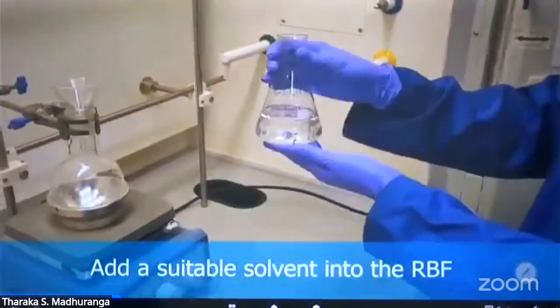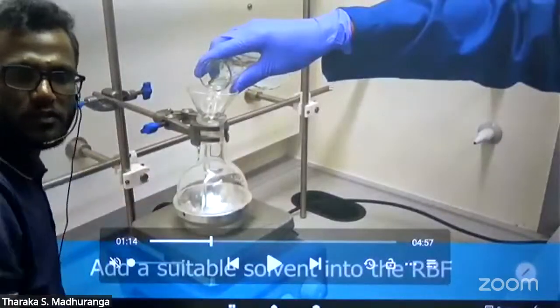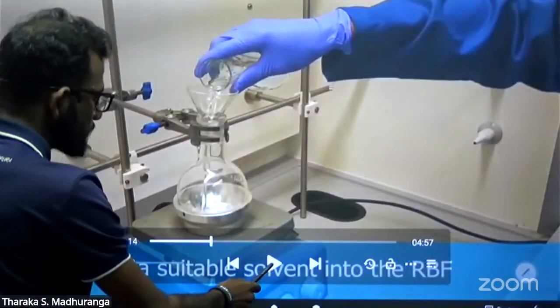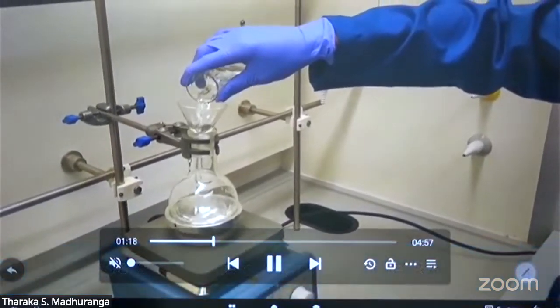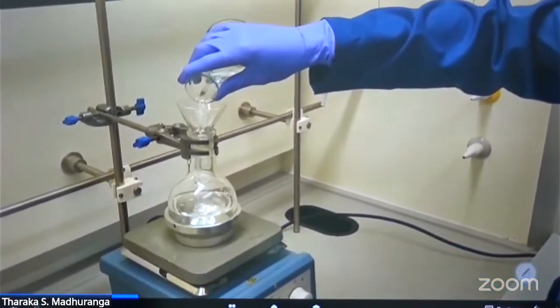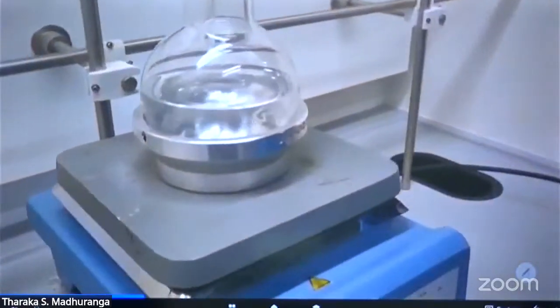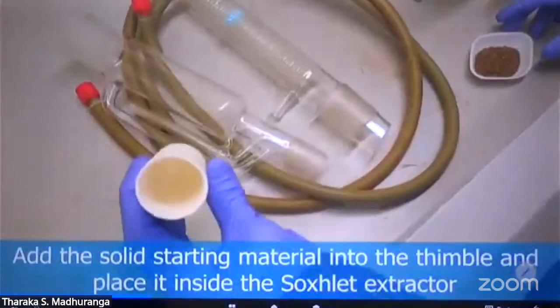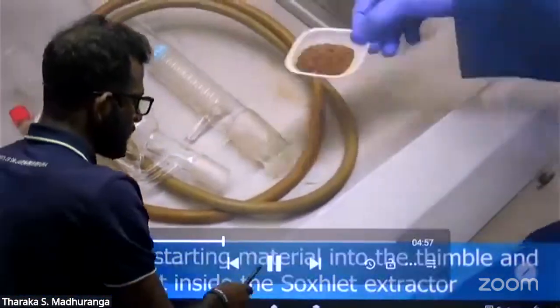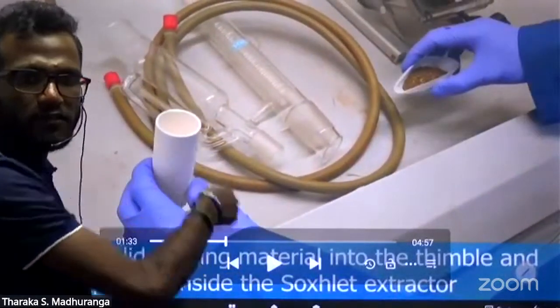That's a funnel. Then that's the solvent. We fill the solvent into the solvent chamber. That's a filter paper cup.